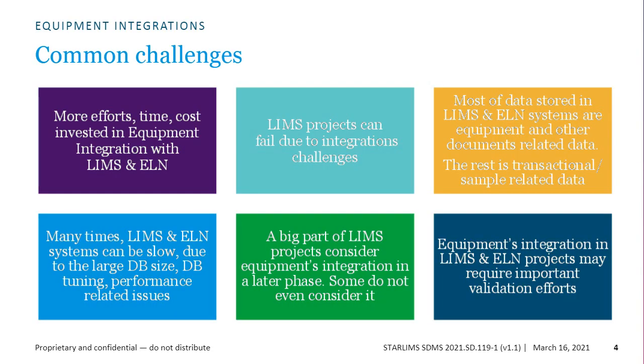So when we talk about some of the common challenges in the current practice, I would like to recap. When I say the current practice, you buy a LIMS, you buy an ELN, you buy an SDMS, or you do not have an SDMS and you just have a LIMS and you integrate with equipment with some kind of middleware. So some of the common challenges today, what we witness is it requires a lot of effort in terms of time and cost in integrating your equipment with the LIMS and ELN, because the LIMS and ELN systems are not originally built to integrate.